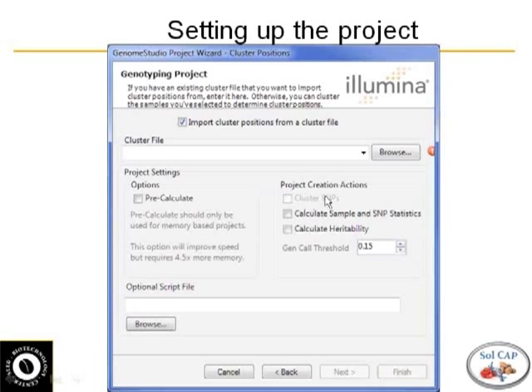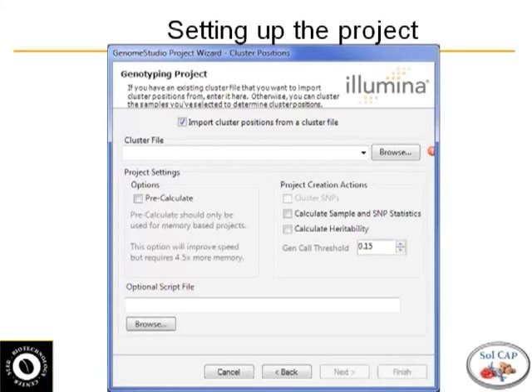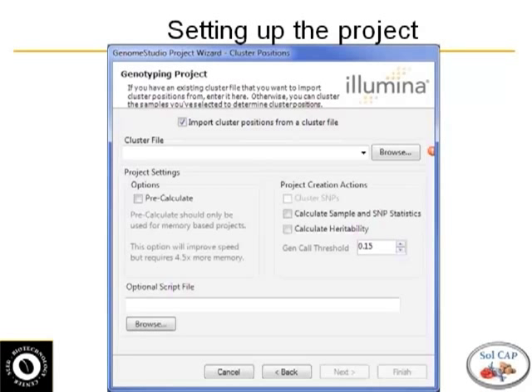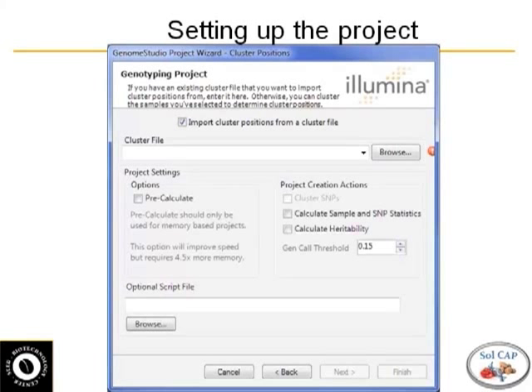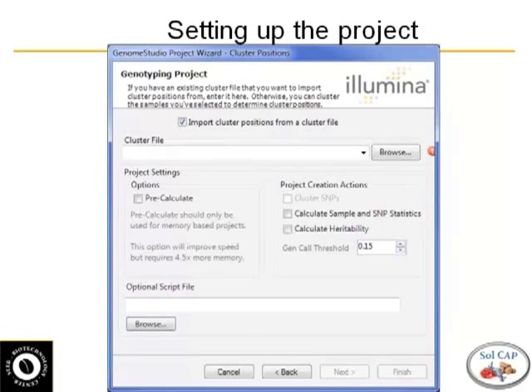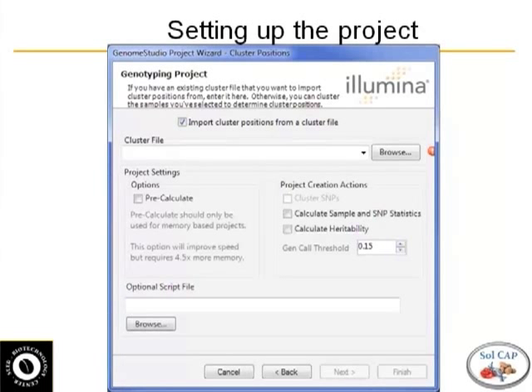And you want to click on, you want to cluster SNP. So cluster is, I'll show you in the next window, basically you get clusters of homozygotes, heterozygotes, and then the alternate homozygote. You have to define those and they have algorithms that will automatically look at that. What it's really doing is looking at how much red, how much green am I really seeing in my sample and it will put that on a scale and call the genotypes accordingly.